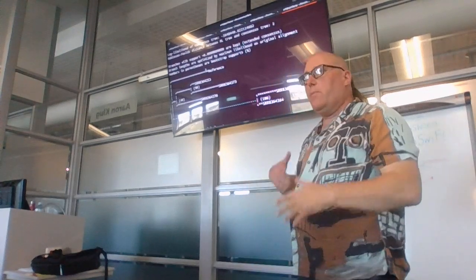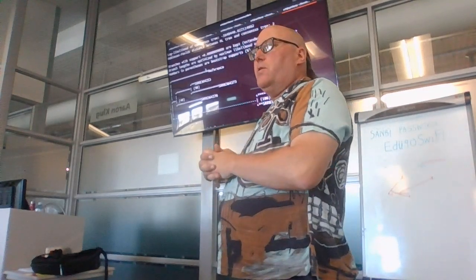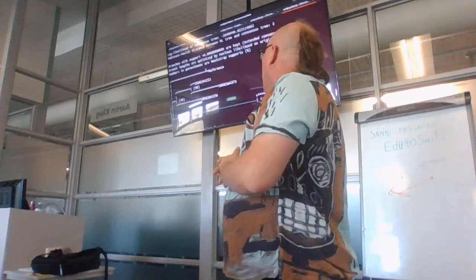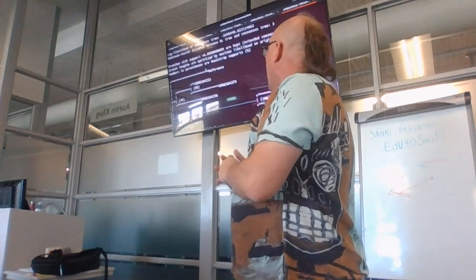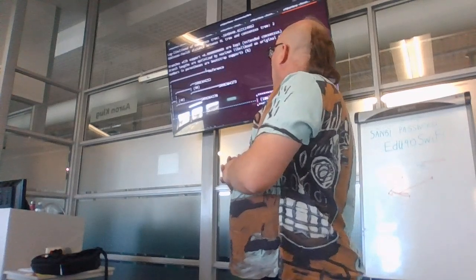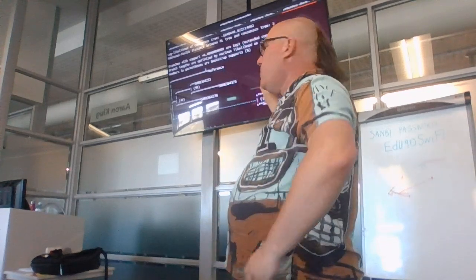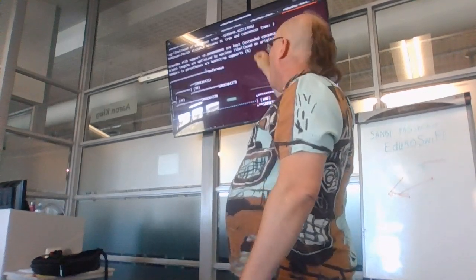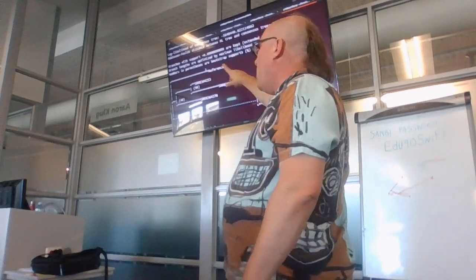It means that, remember, 40% is when you calculate the tree, 40% of the trees had that particular agreement. Okay, but the reference. What does it mean that the reference is over there and that branch length is that? In terms of time, we know that the reference was collected before any of these.